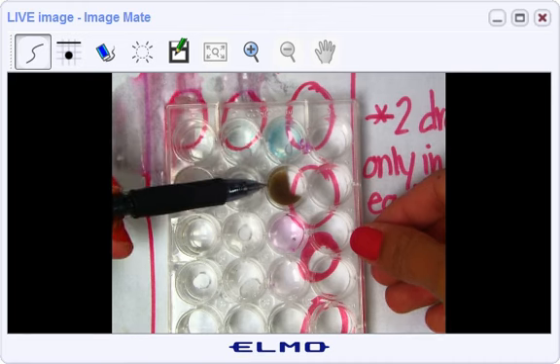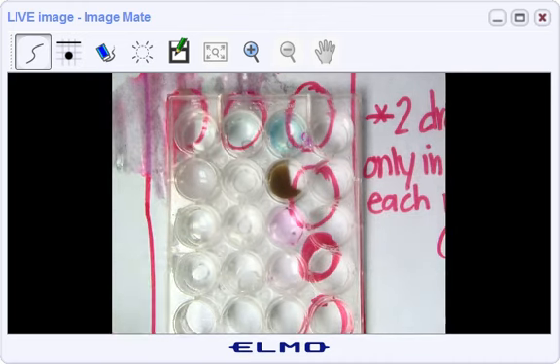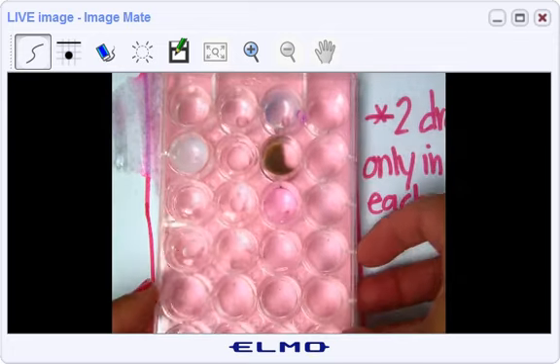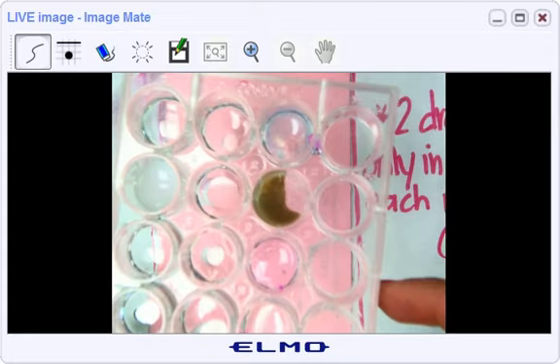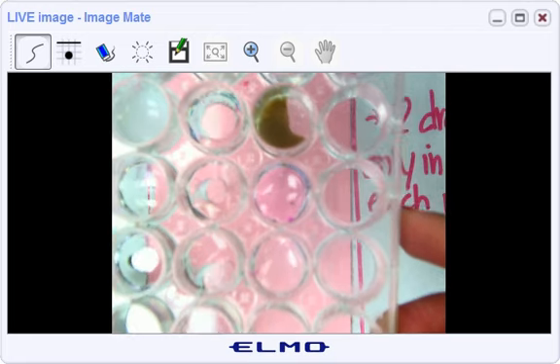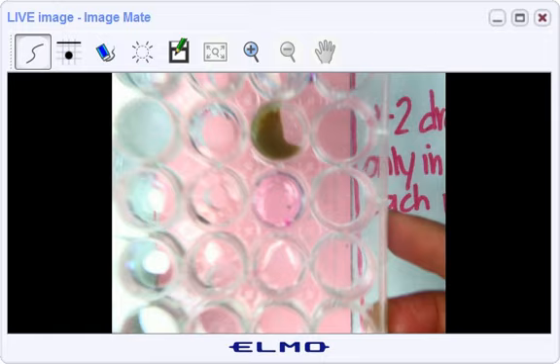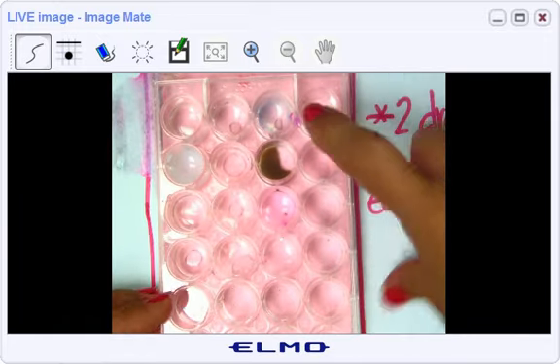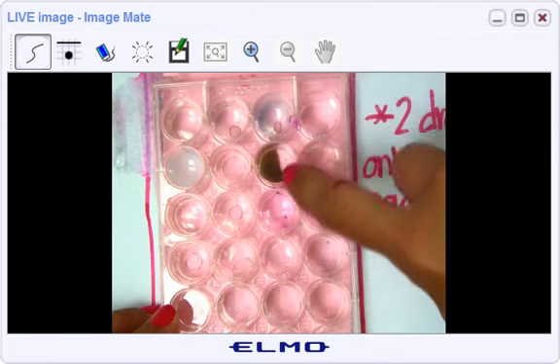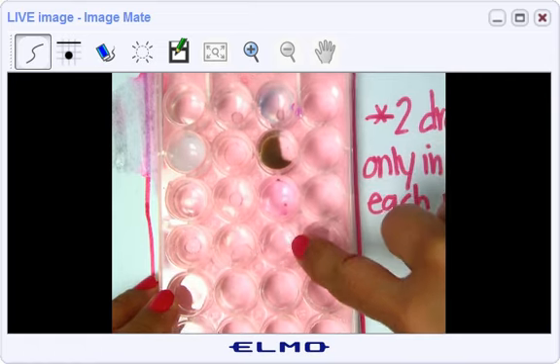And your very last column, it's a little difficult to see. Put a darker sheet of paper under it and you can see the change of color. And the very top one of column 3 and the second one, write those down. The very last 2, no precipitate. So this column right here is the NaOH observation data boxes. Precipitate, precipitate, no precipitate, no precipitate.